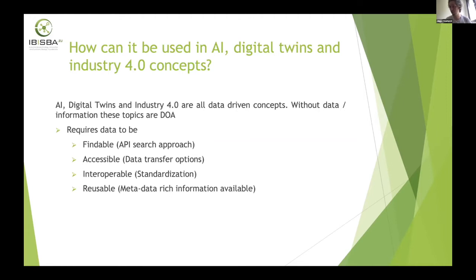When was this sample taken? What kind of sample is this? What experiment did it belong to? For what study was this sample for? So all this additional metadata information is extremely important, that this is recorded properly under standardized ways, to be able to reuse it for yourself.